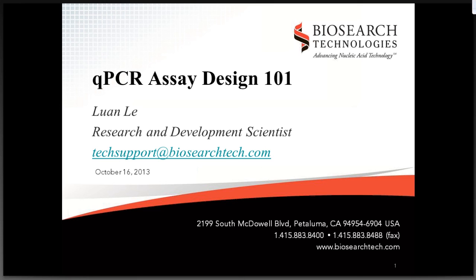So you mentioned BHQ plus probes. Aside from SNP genotyping, what other situations are those recommended in? I recommend them if you're doing gene expression, you try to design it as just a regular BHQ probe, and you get no results. It might be a situation where you have a problematic sequence, such as an AT-rich region.